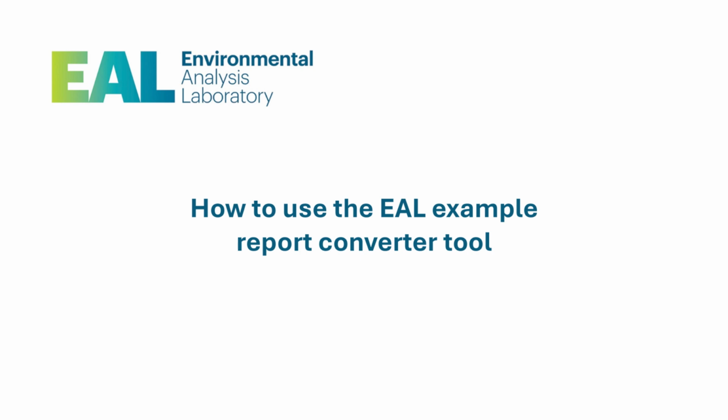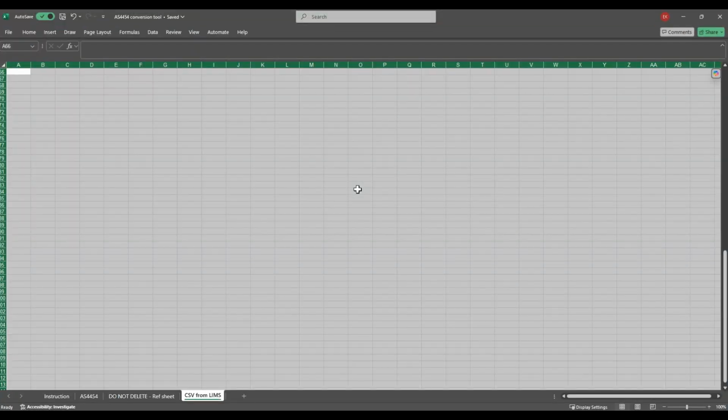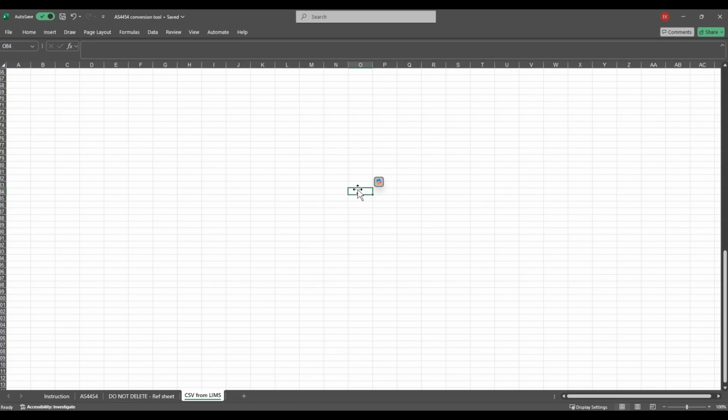This video provides a short demonstration on how to use the EAL report converter. When using the tool, please make sure that you have verified that it is working correctly for your data. First, open the version of the EAL report converter that corresponds to your report type.